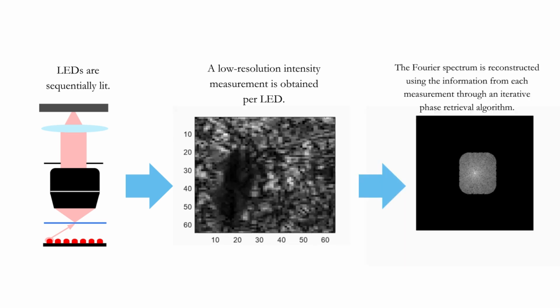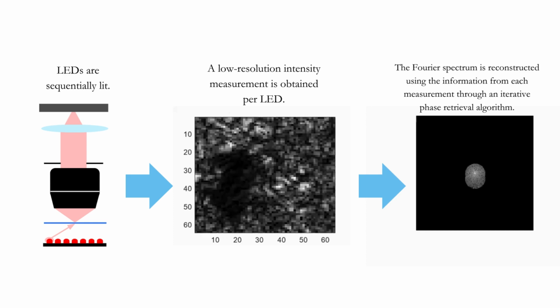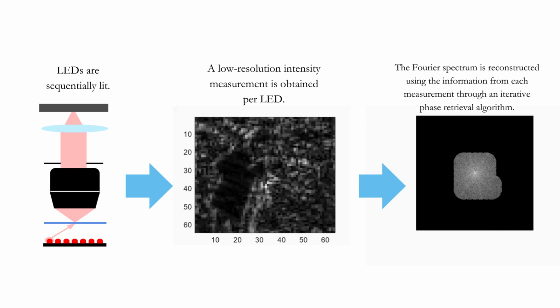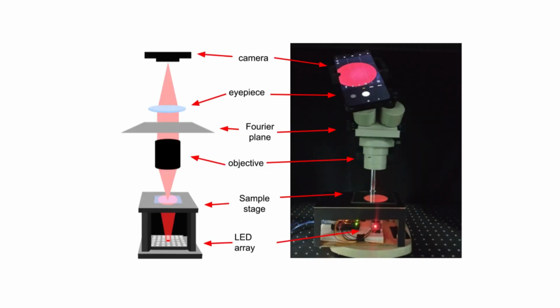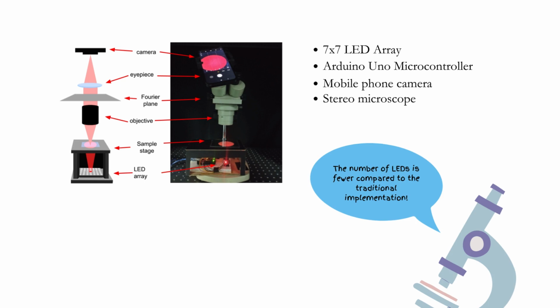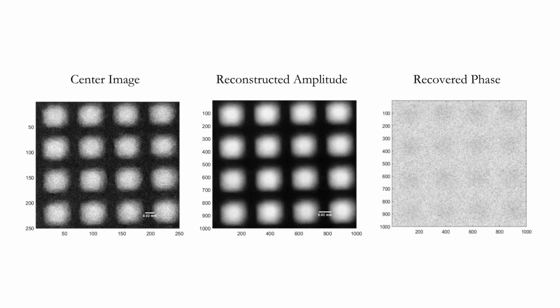Using the correlation between these oblique plane waves in the spatial and frequency domain, we can obtain a complex object solution that is coherent with all of the measurements. Experiments are conducted where accessible materials are used for practicality. This is a sneak peek of my results.